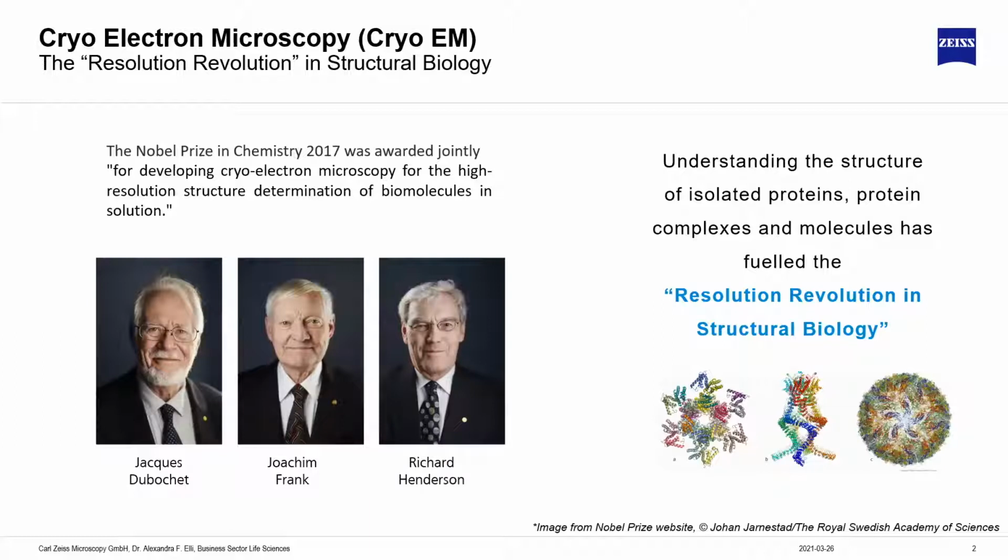Since the award of the Nobel Prize in Chemistry in 2017 for developing cryo-electron microscopy for the high-resolution structure determination of biomolecules in solution, the resolution revolution, as it is commonly known, has driven incredible progress in understanding of the structure of isolated proteins, protein complexes, and molecules that could not be studied in any other way.